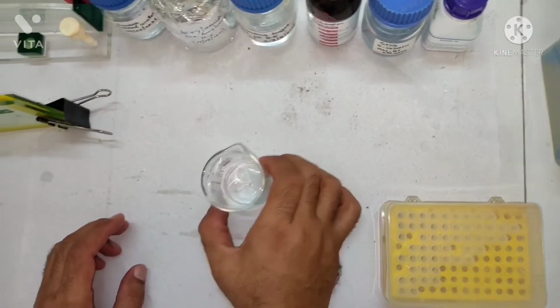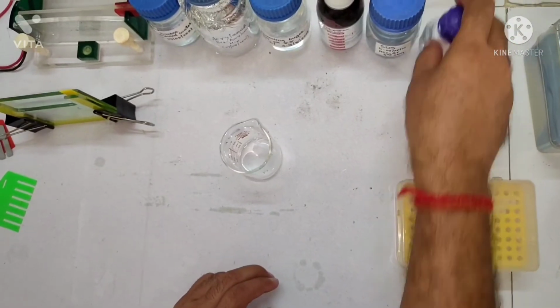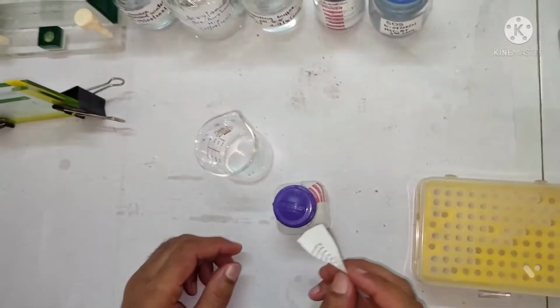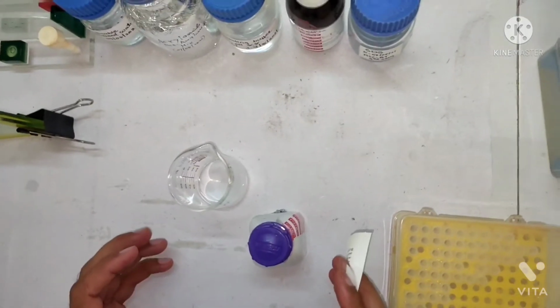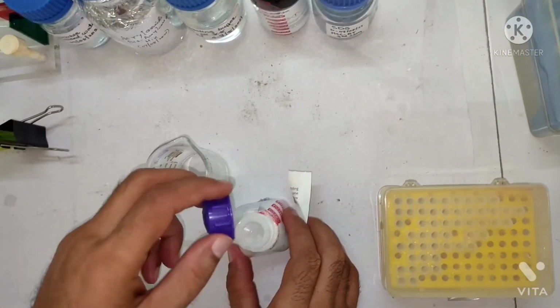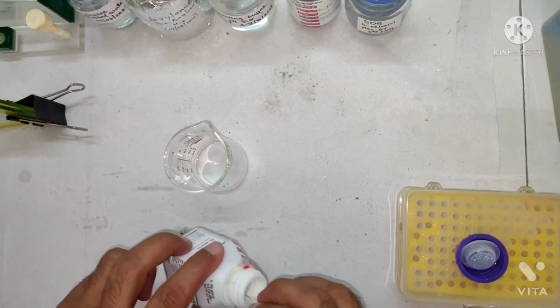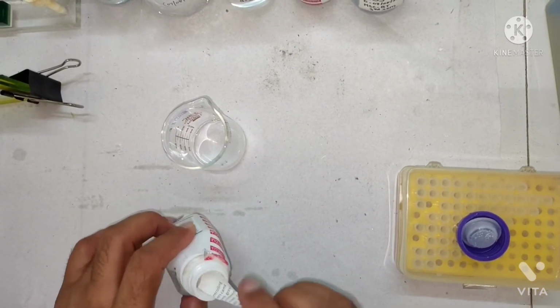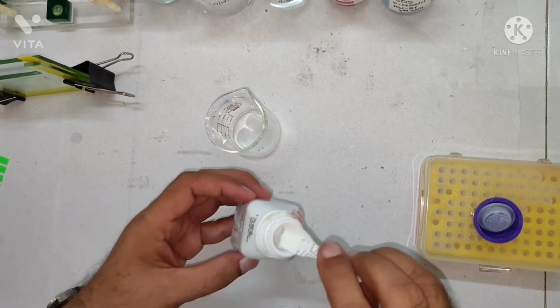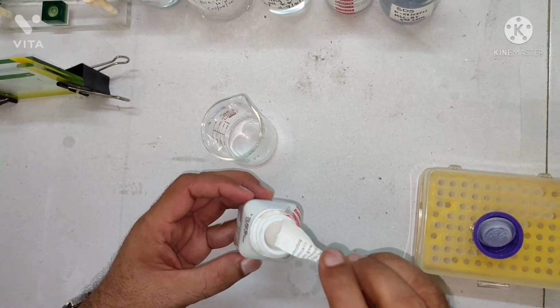Mixing is always very important, right? So mix it. Now the last chemical, which is APS, right? So APS is a very important chemical here, and once you add APS, the polymerization starts. You can add 50 microliter of 10% APS, or you can prepare a solution, but here I am adding a pinch of APS. So just take a pinch of APS here. Some more is needed. It is too much, and just see, for 10 ml just a pinch of APS, and fresh APS is required, right? So don't take some old APS.